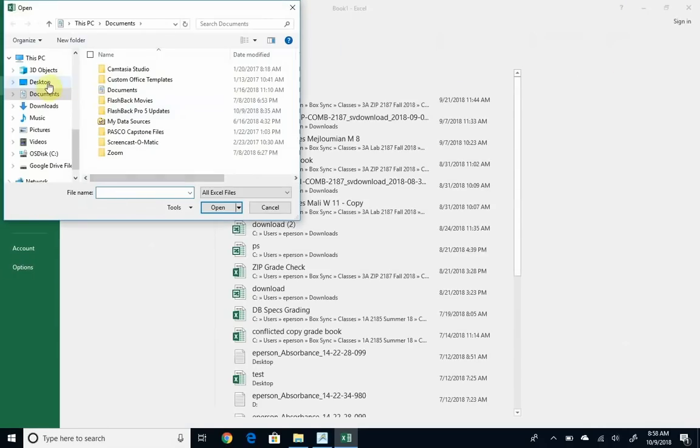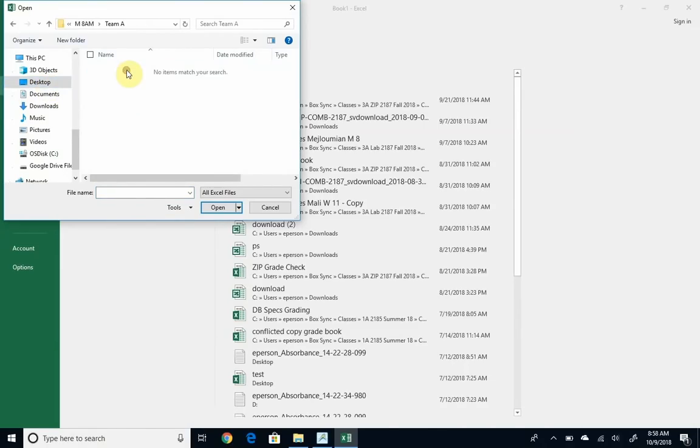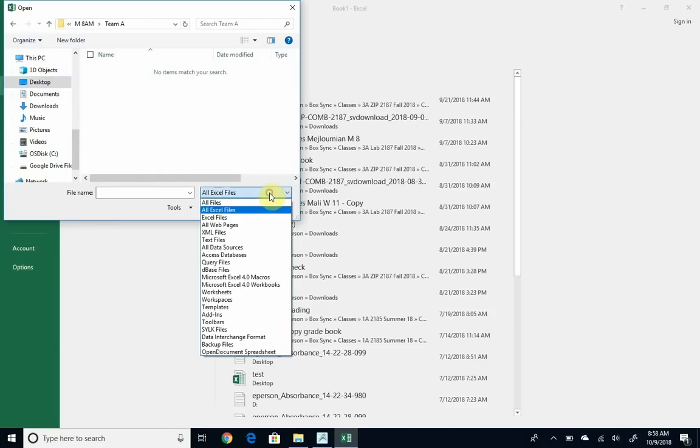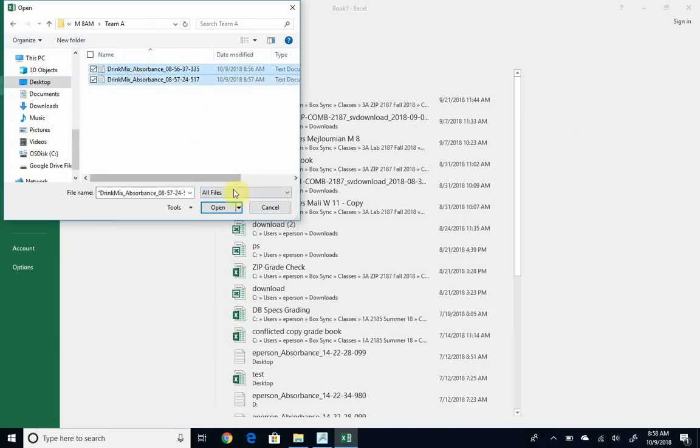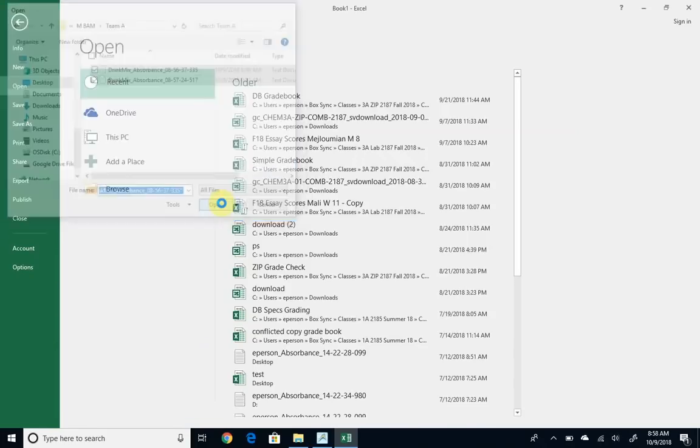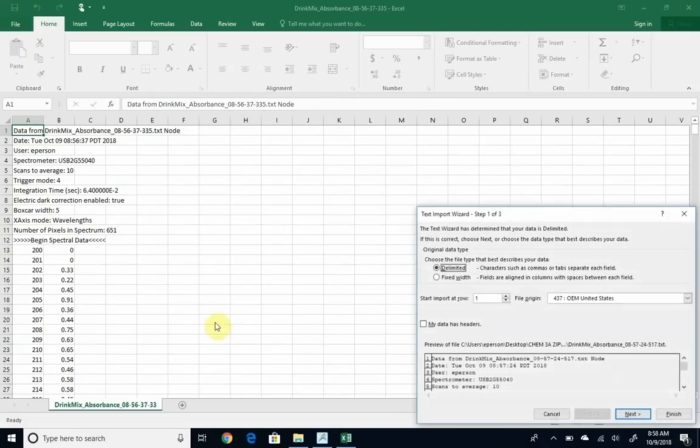So I'll browse and go to the desktop, Chem 3A zip. And right now it says only look for Excel files, I want it to look for everything. And I can click on these two files, open them, and if you just click finish, it does a pretty good job just on its own.